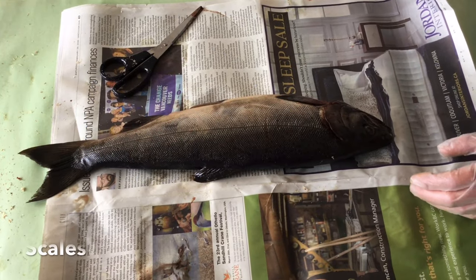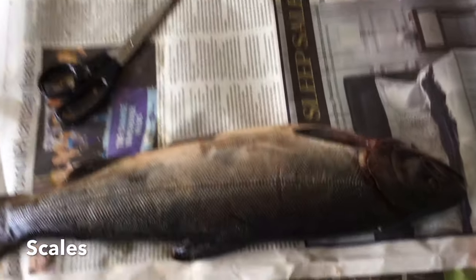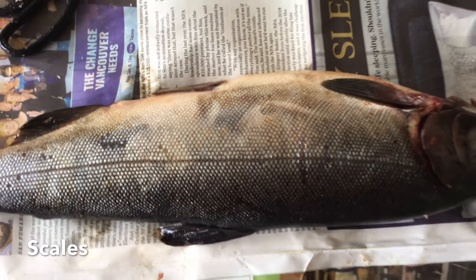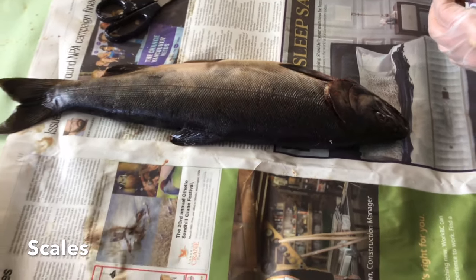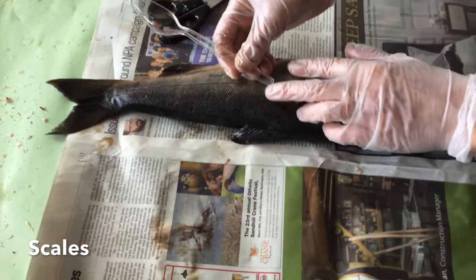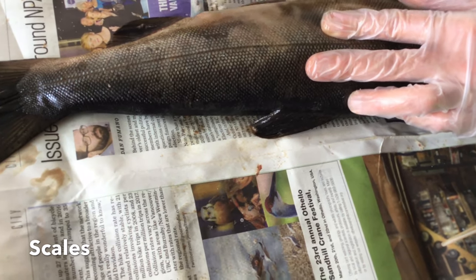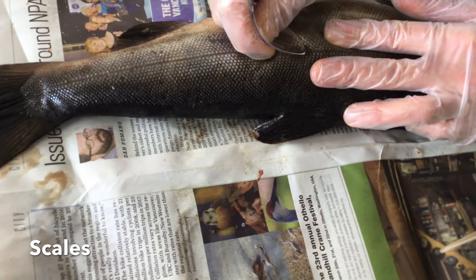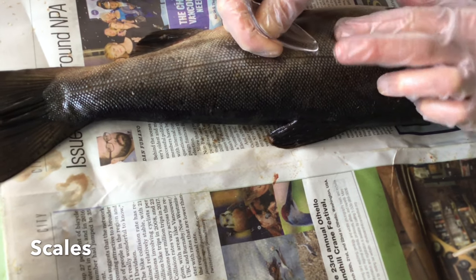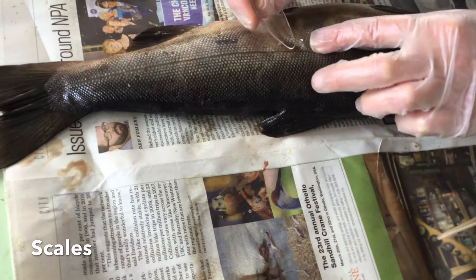The scales. This is the next part of the external anatomy that we will look at. So we're going to go back to the coat. That's where the scales are. And Miss Anima is going to remove several scales with the spoon. And as you can see, they are very, very tiny. But they are very hard, like a fingernail.